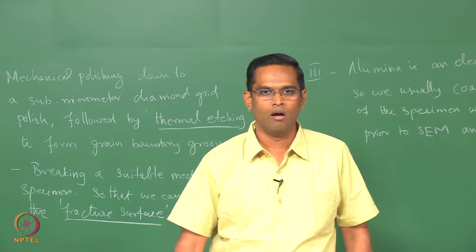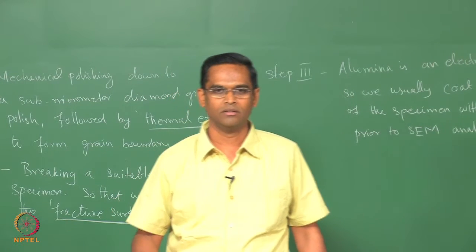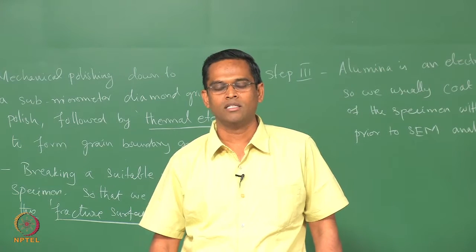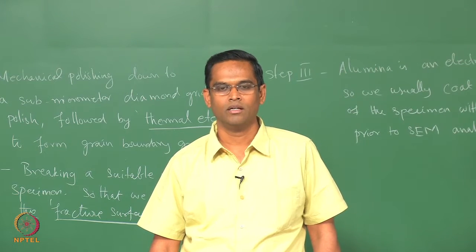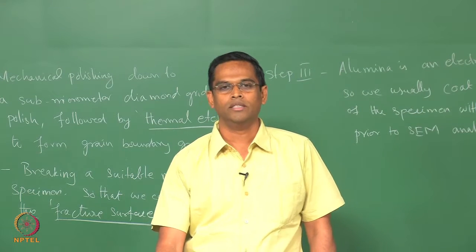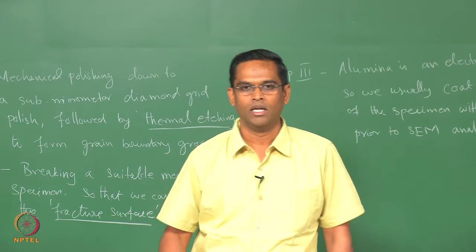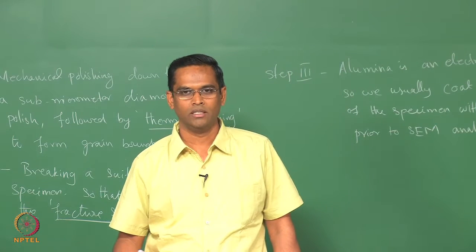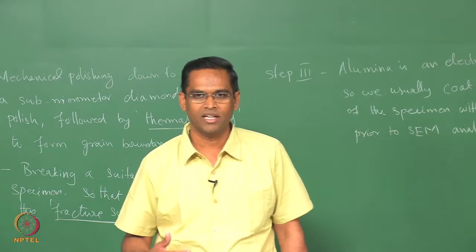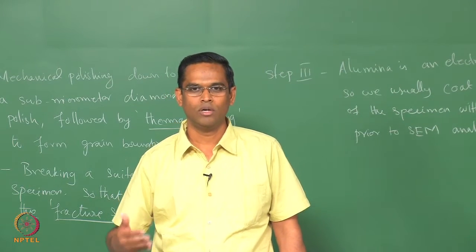So, all that you have to remember, you have to go back and recollect what we have discussed in the theory classes. I just mentioned in the image formation mechanisms, in SEM you form an image primarily by the secondary electrons coming from the immediate surface. I also mentioned that you have SE1, SE2 and SE3.